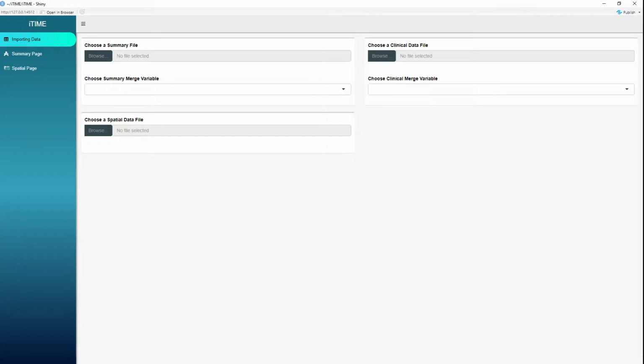So if we go over into this application, I will load in the data. So you can see right away, it looks nicer than other Shiny applications. In other Shiny applications that I've made, you have this sidebar across the top and you can do the different tabs and stuff. And it looks more from the 1990s, but this looks really nice.